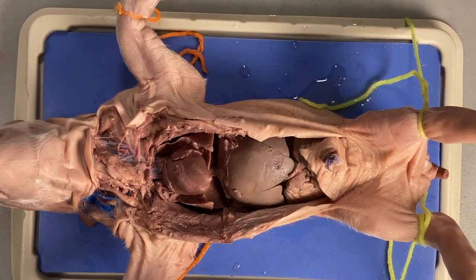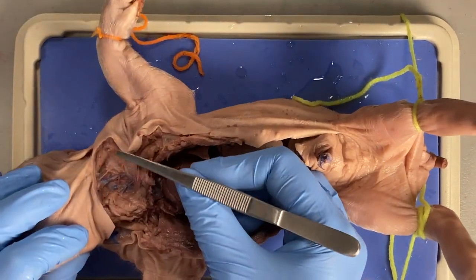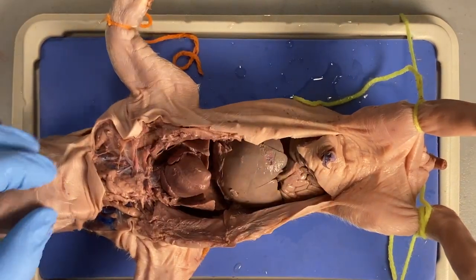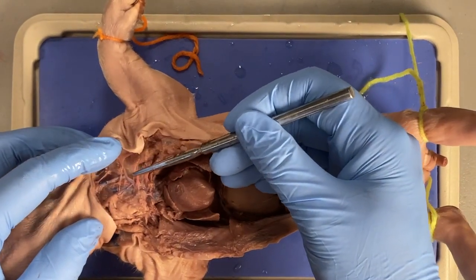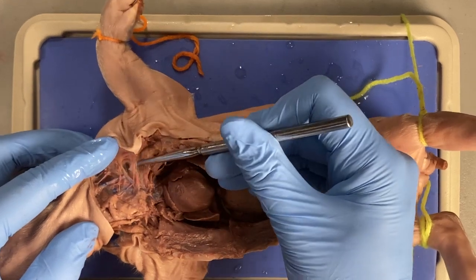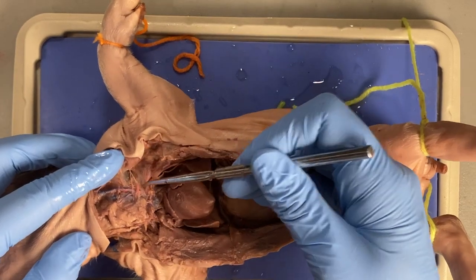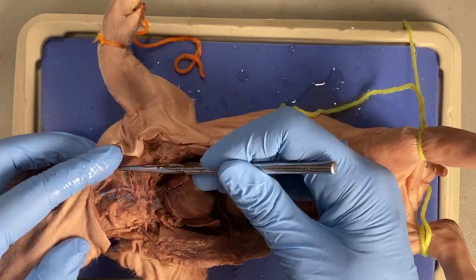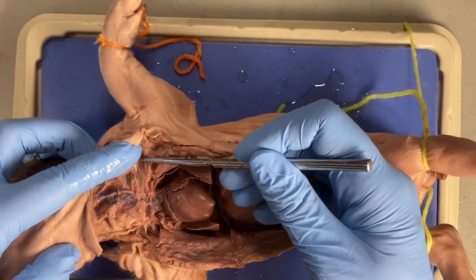I would honestly use the edge of the forceps to try to dig through. It just takes time — you can kind of see pink here and blue here, so I'm just going to try to get the connective tissue between those separated. You're going to end up tearing through some vessels and that's okay. The pink and blue is just latex that's been injected so you can see where the blood vessels go.